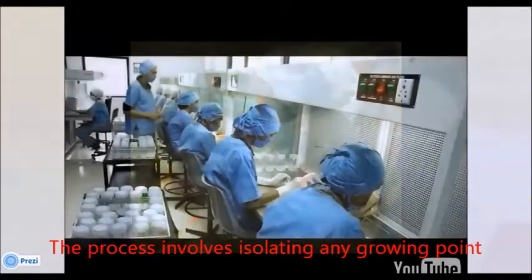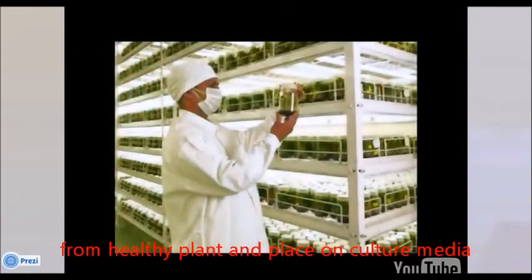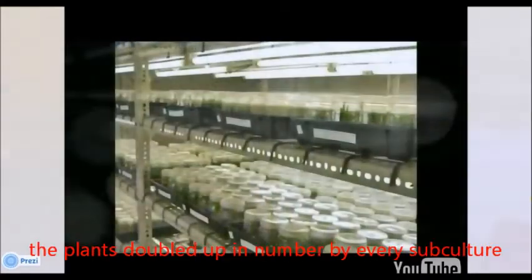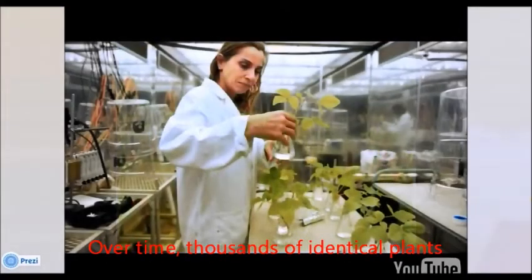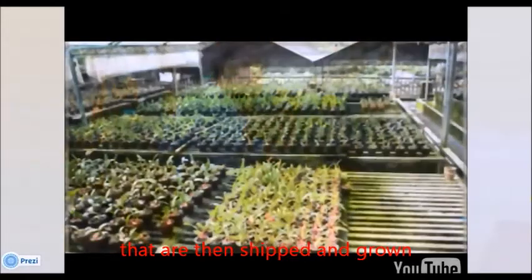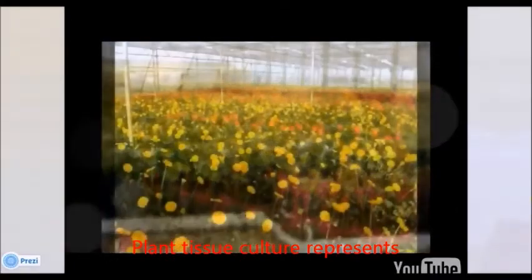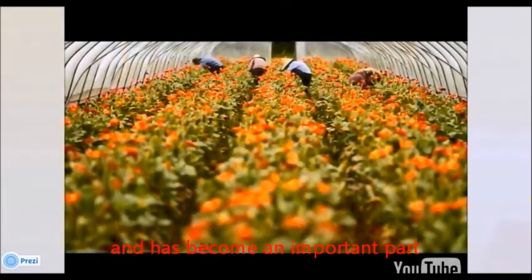The process involves isolating any growing point from a healthy plant and placing it on culture media. Once successfully established, the plant doubles in numbers with every subculture. Over time, thousands of identical plants are then shipped and grown by commercial breeders around the world. Plant tissue culture represents an efficient method of plant propagation and has become an important part of both horticulture and agriculture.